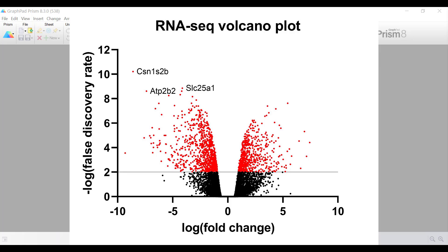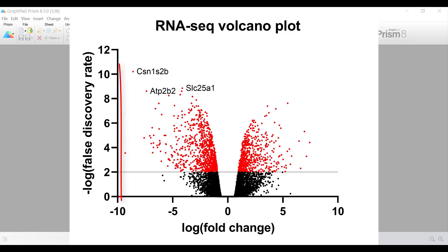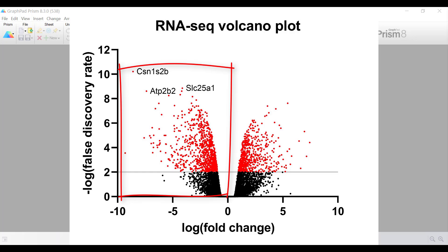The genes that are at the top of the graph are those with the lowest adjusted p-value, which is shown as a higher negative log FDR value. In other words, these are more significant than those at the bottom of the graph. Genes that are upregulated are plotted to the right side of the graph, indicated with a positive log-fold change value, and genes that are downregulated are plotted on the left side of the graph, indicated with a negative log-fold change value.